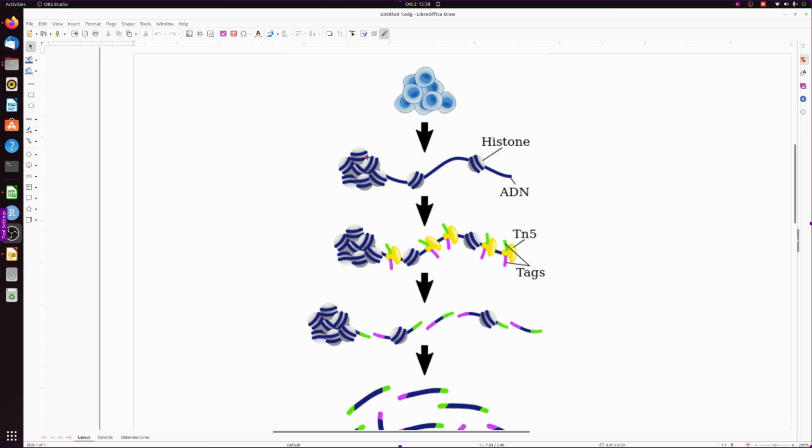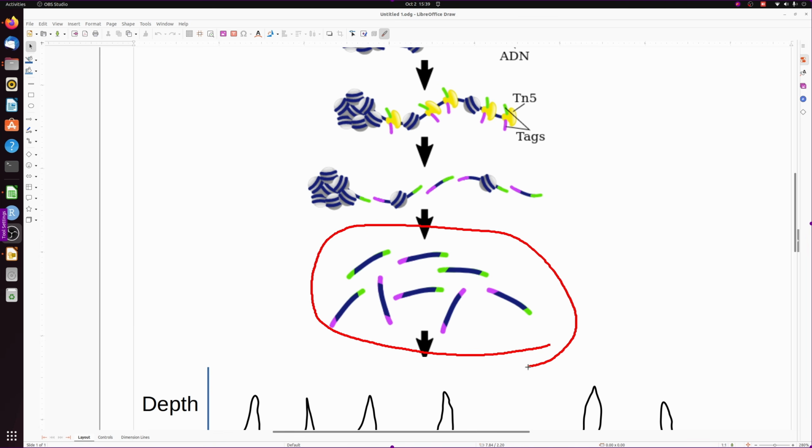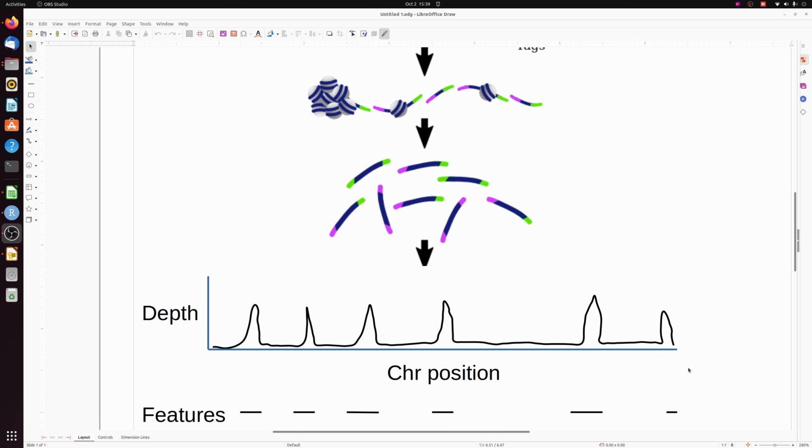Alright, so just a brief introduction into ATAC-seq. Basically, the main idea is that we're going to sequence the accessible regions, not the ones that are wrapped tightly. So these transposases can bind to the accessible regions, but not these regions. They chop up and tag the pieces that they could reach. So we're left with a bunch of fragments that we can then map to a reference genome. In single-cell ATAC-seq, we do this in each individual nucleus.